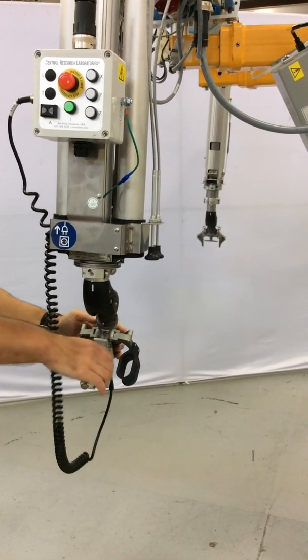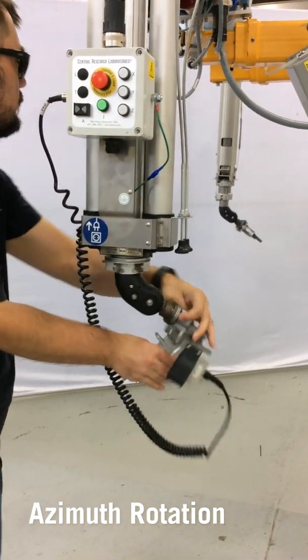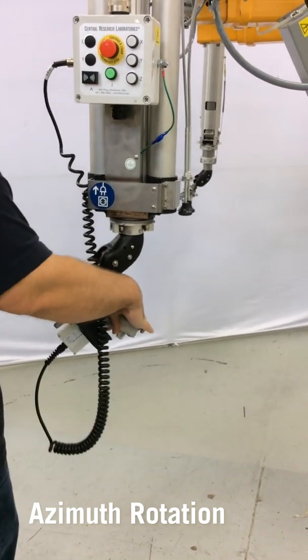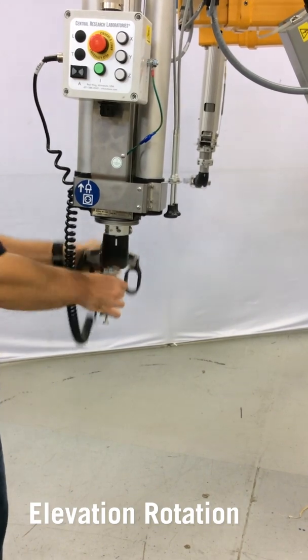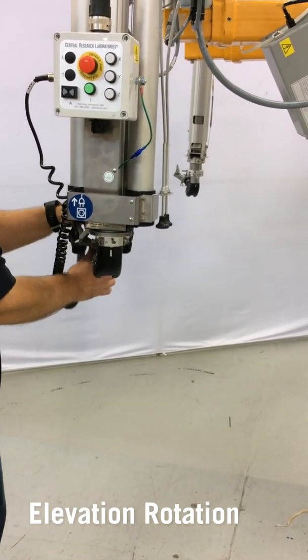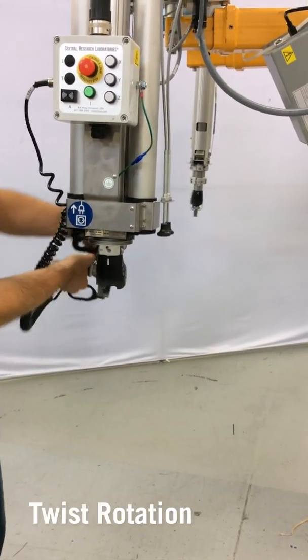The wrist motions start with azimuth. This rotates the wrist joint around the axis of the slave arm. Elevation rotation pitches the tong up and down. And then twist rotation twists the tong.